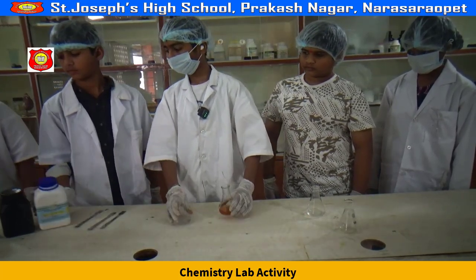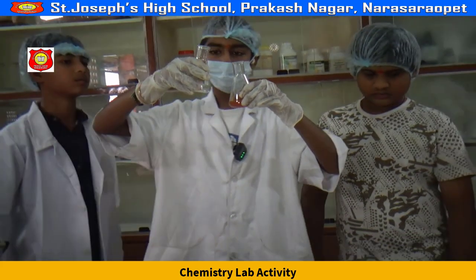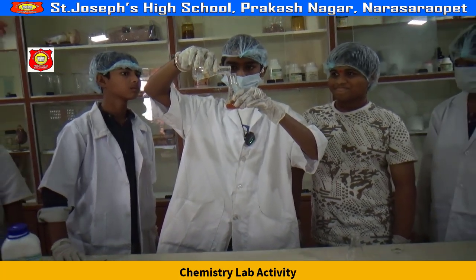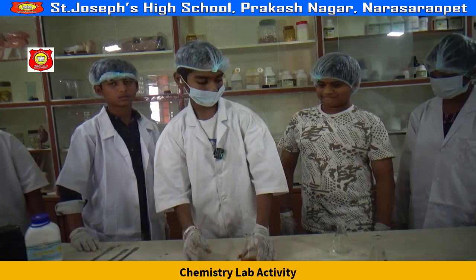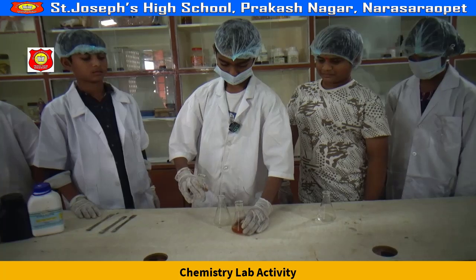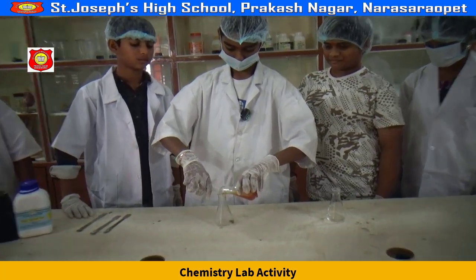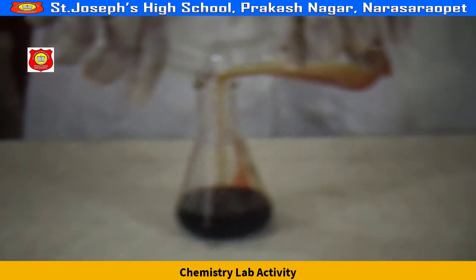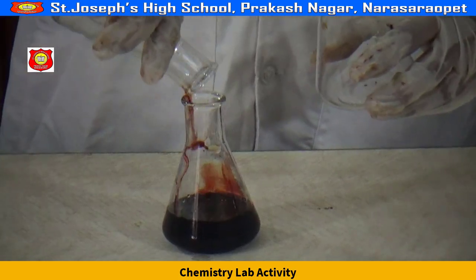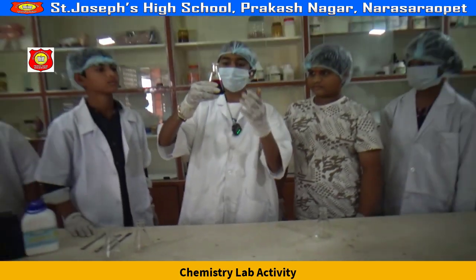Now, when we mix this potassium thiocyanate and ferric chloride anhydrous, we are going to get the fake blood. Let's mix it in another beaker. Now we got the fake blood.